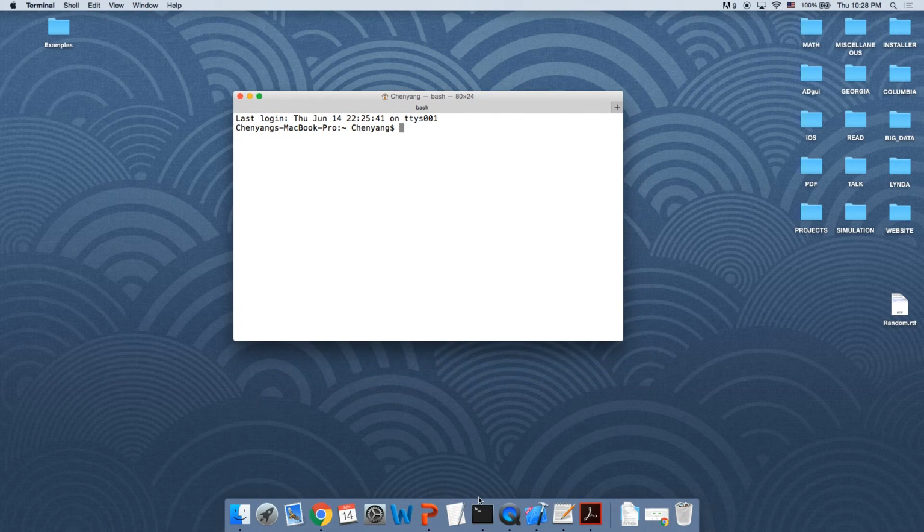So first thing is to invoke a terminal like this. And let's check the conda version by typing conda -V. So I'm using conda 4.5.4. And in order to install xINTERPDF, first of all, let's see what channels we have. So we type conda config --get channels.